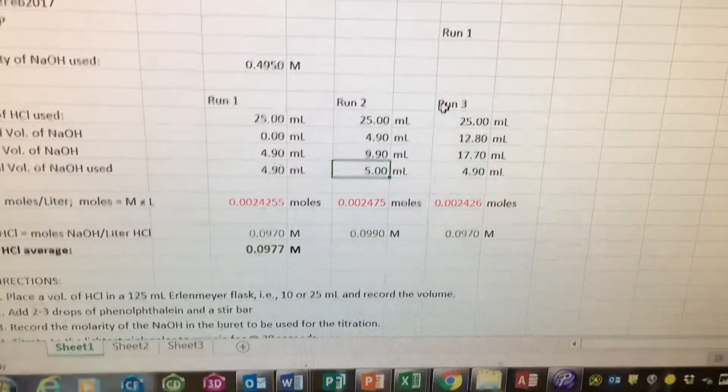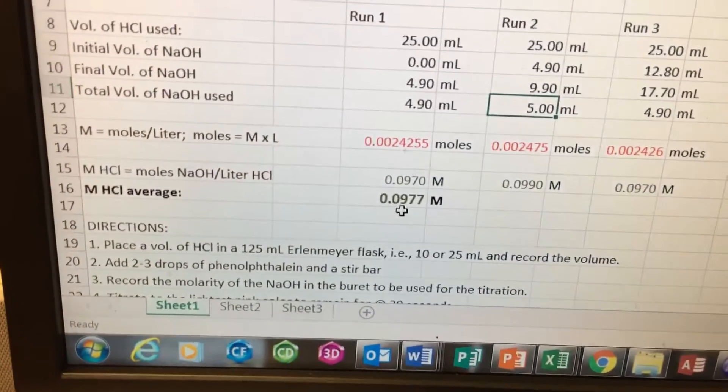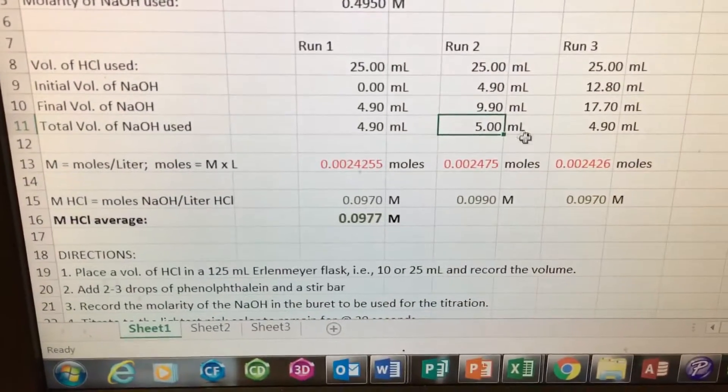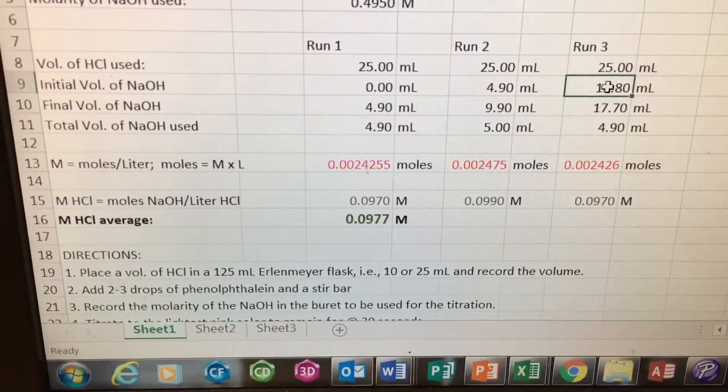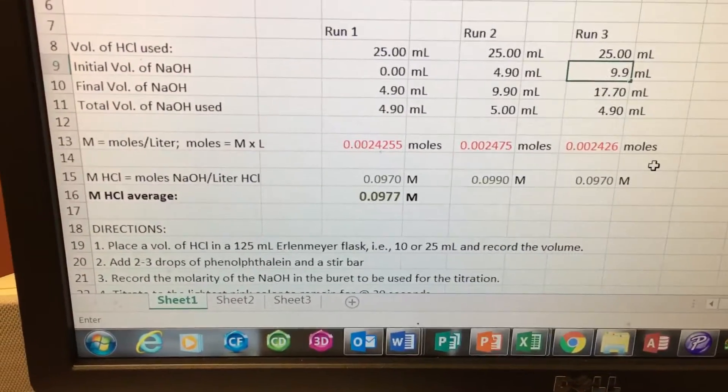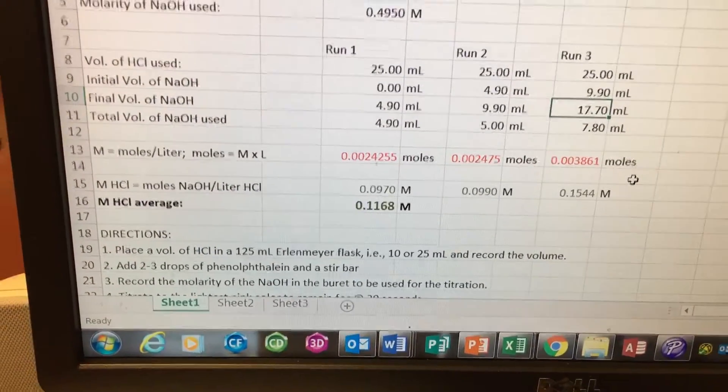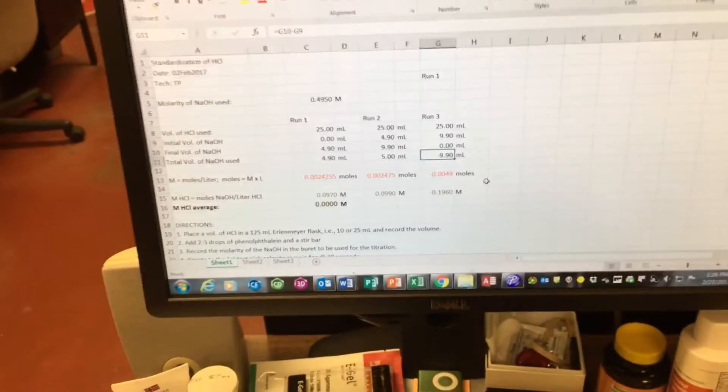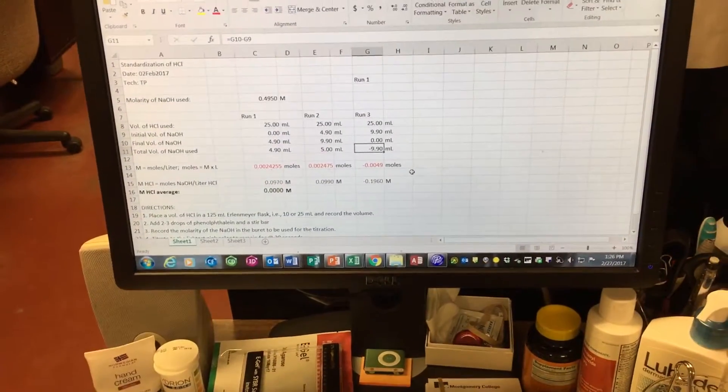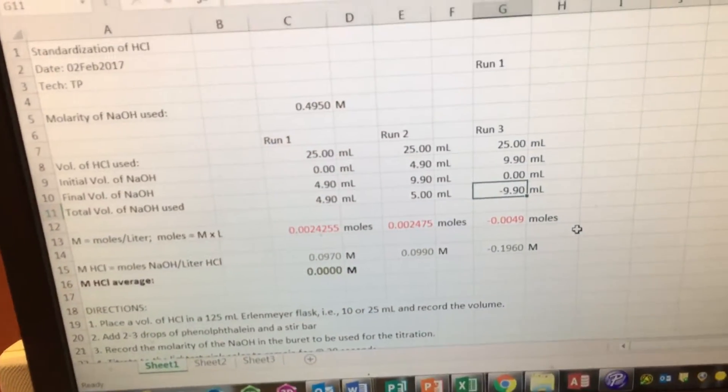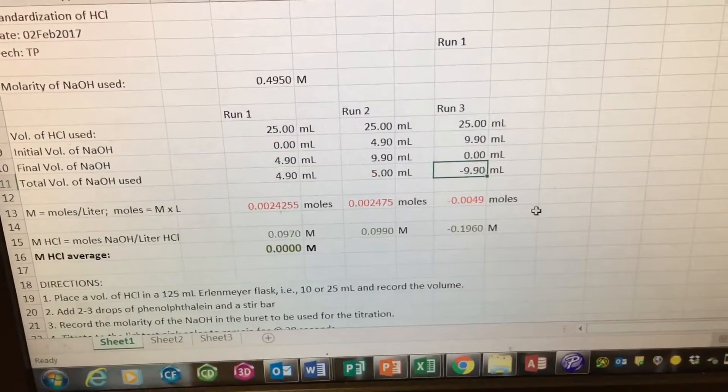I'm gonna do the third trial. So far we almost got about 0.0977 molar. Not bad. So we're gonna start initial volume at 9.9 right there, and we're gonna enter that zero. We got one more run. It should conclude the titration, the standardization of this hydrochloric acid for the day. All right, I'll keep you posted. Bye.